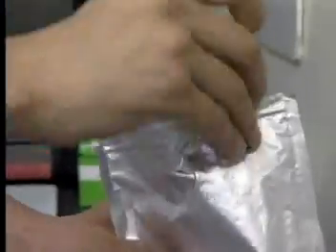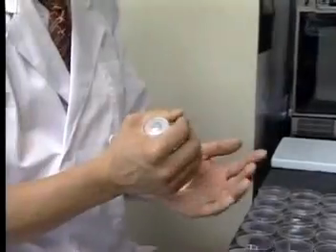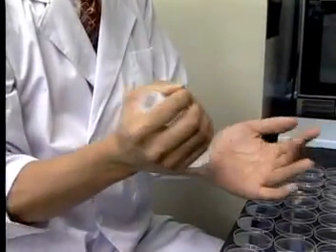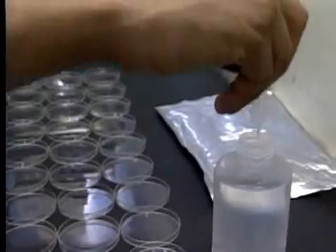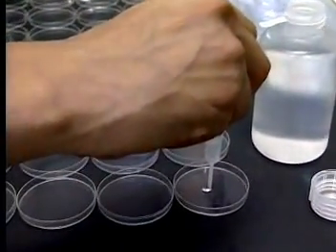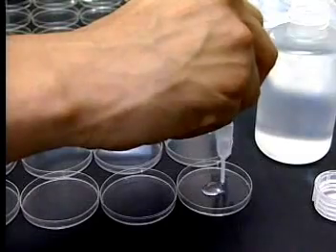He brings the water back to the institute as specimen. First, he taps the bottom of the container to activate the water. Then, he squirts one milliliter of water onto each petri dish.